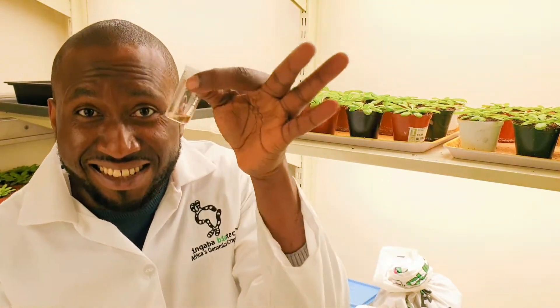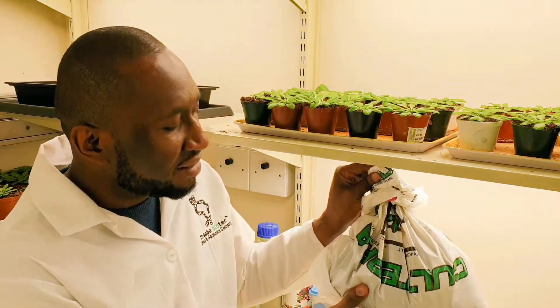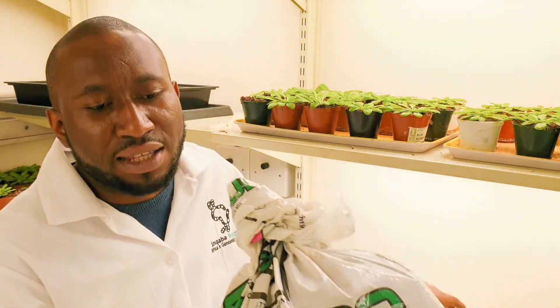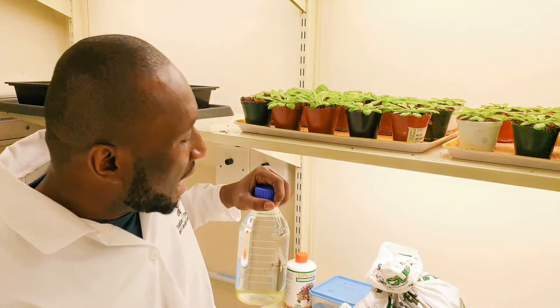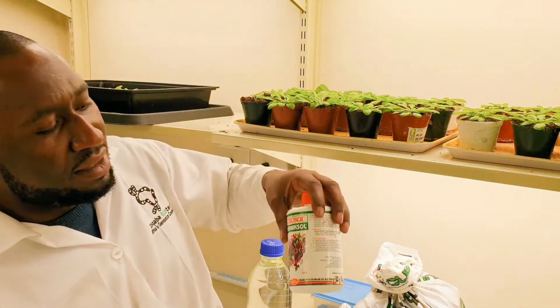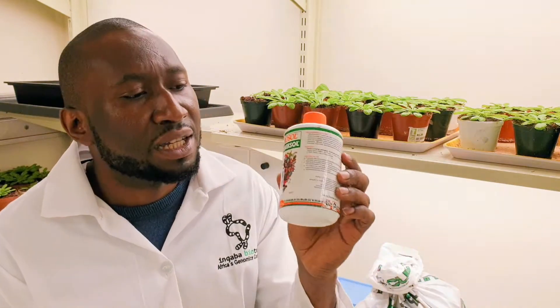So you need seeds. In fact there are about 5000 seeds in this container — a lot of seeds. You need soil — I actually use cutter soil. You need water, H2O. I also use this plant food called Nitrosol, which is a natural fertilizer. I use it in the ratio of one milliliter of Nitrosol to 300 milliliters of water to feed my plants once a week.